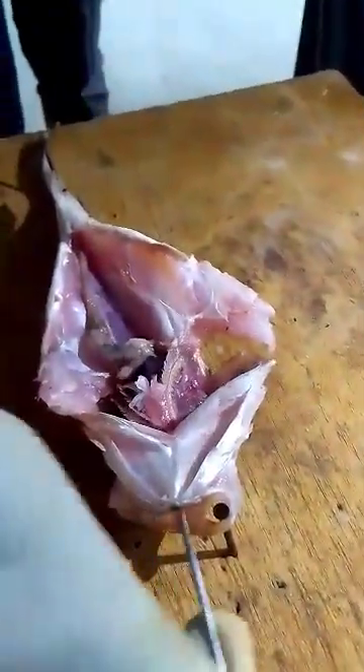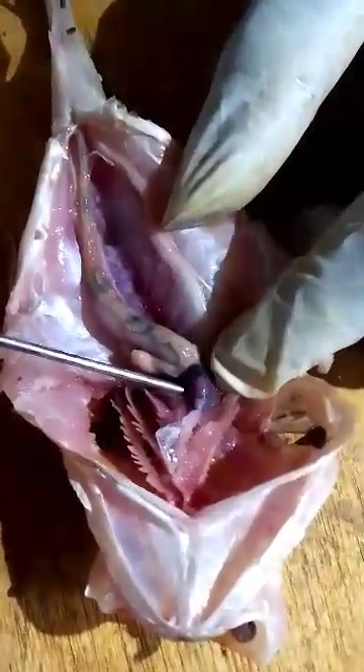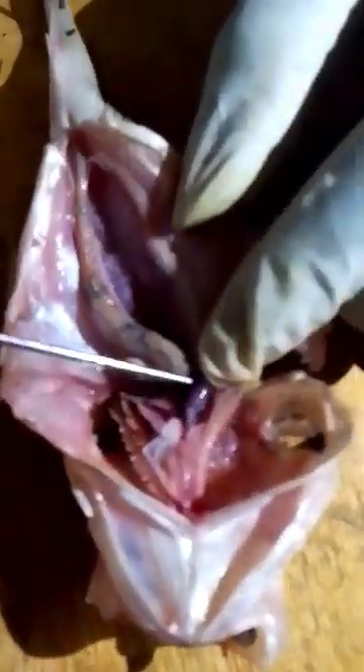After the respiratory system, the next system is the circulatory system. The fish has a single circulatory system, which means blood passes through the heart just once for a complete circulation. This is the heart of the fish — it is covered by a thin tissue called the pericardium.